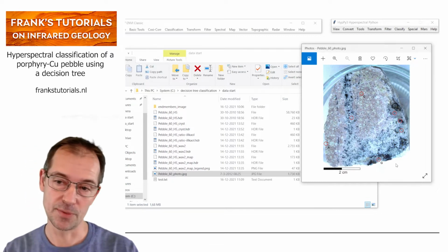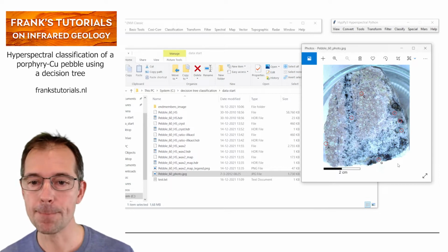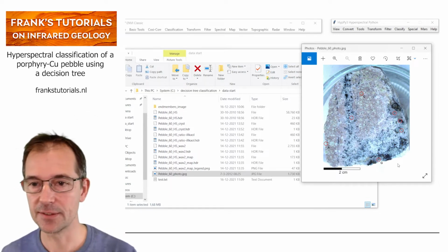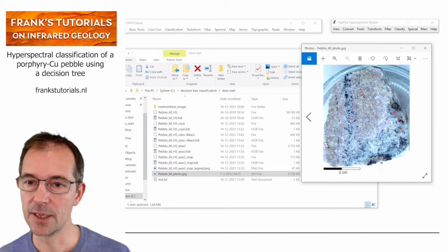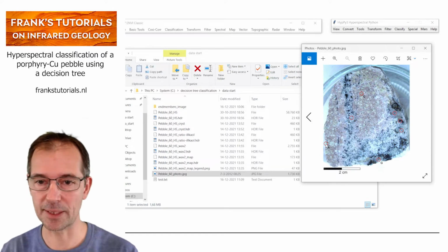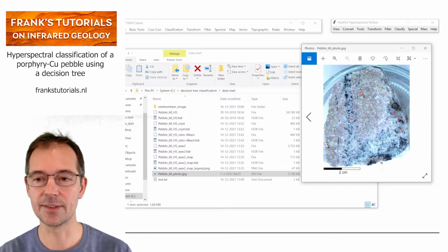So it was a resistant piece of ore rock. Well, we investigated this pebble, and particularly we looked at spectra of point A, B, C and E, which are representative of 4 different spectral minerals, an illite, a muscovite, a kaolinite, and a tourmaline.